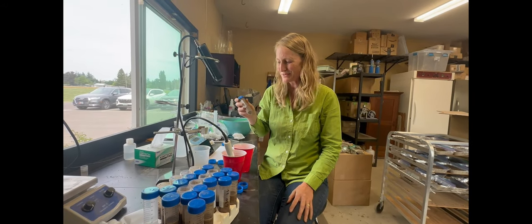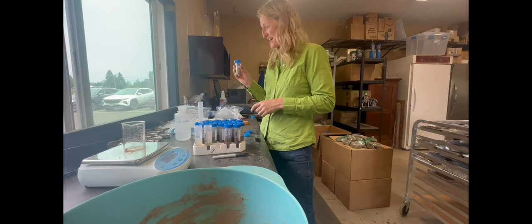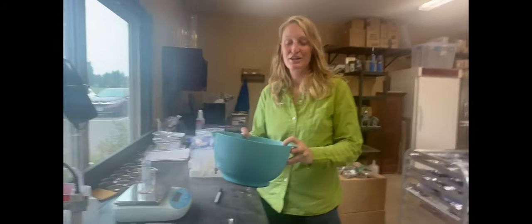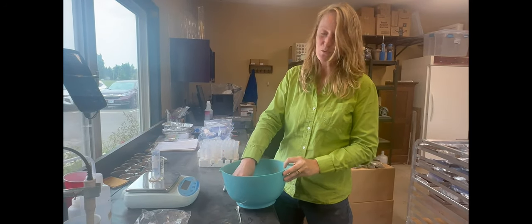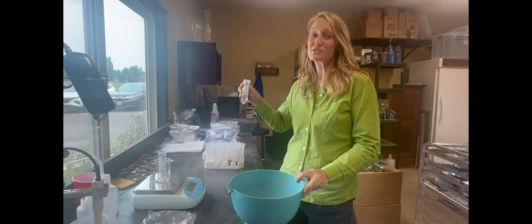We are taking a pH sample. We have the water and the soil added to our tubes, put a lid on it, give it three good shakes. One of the things that soil scientists always do when assessing a soil is use all of their senses — we feel things, we smell things, and we also taste them.